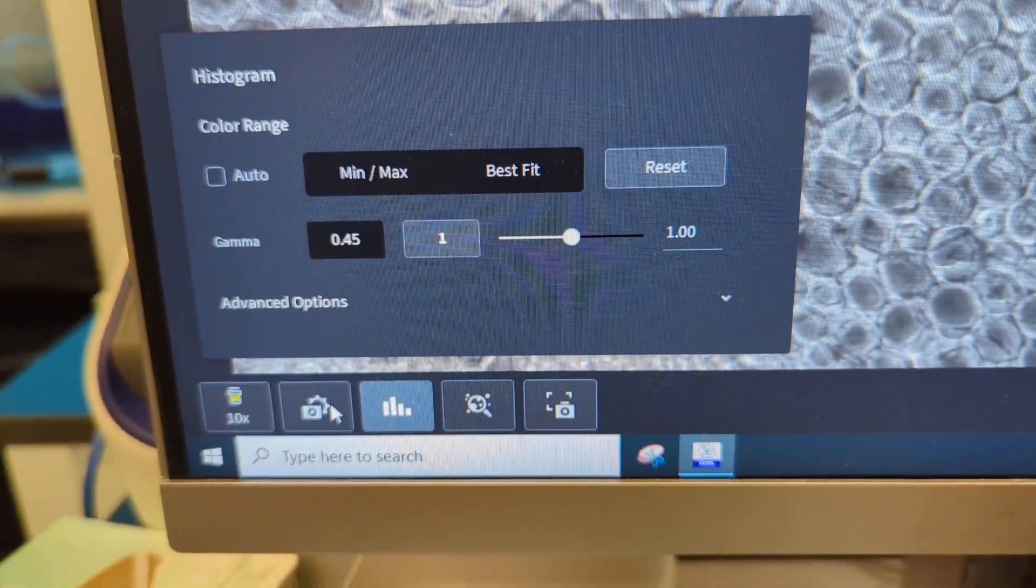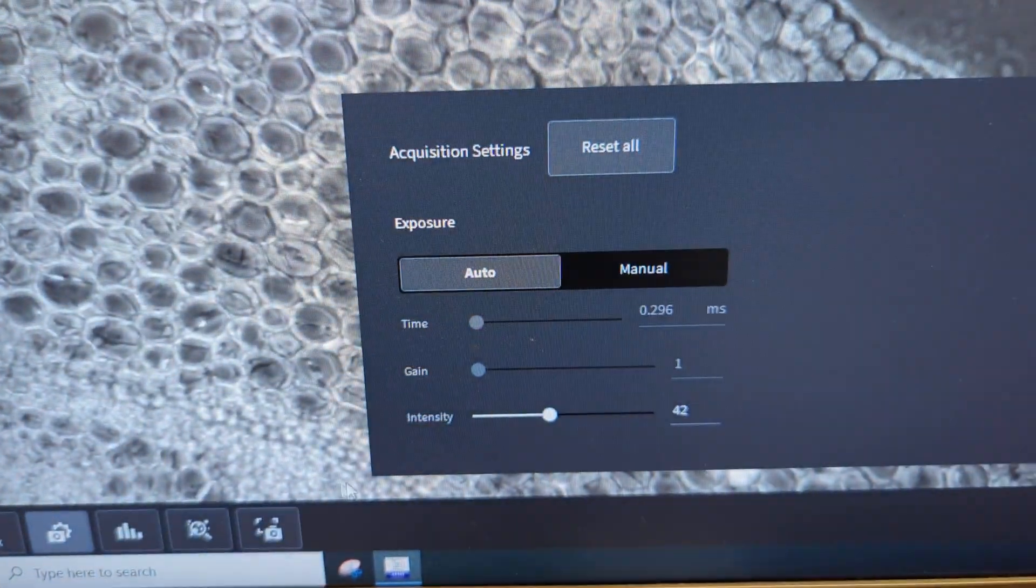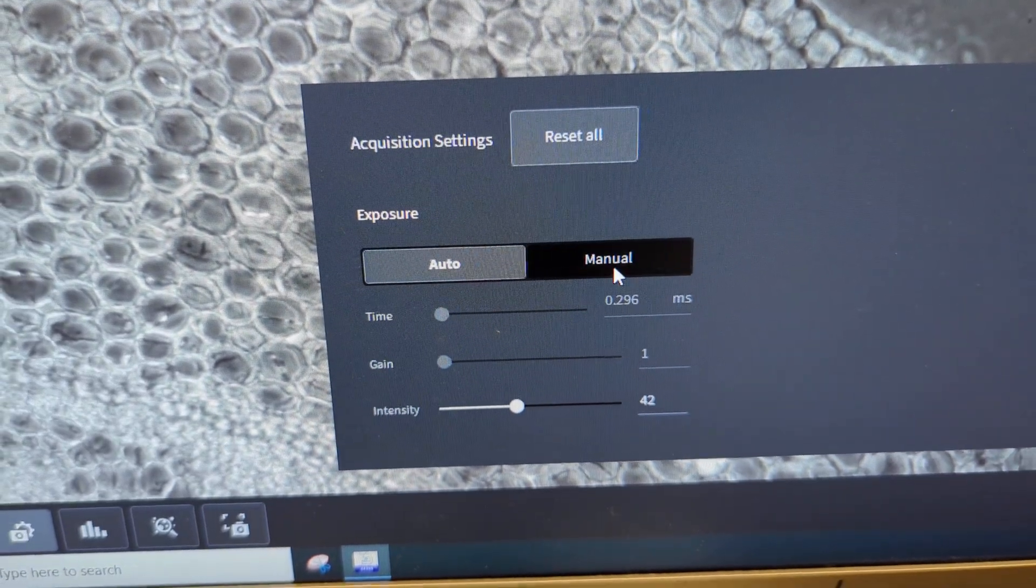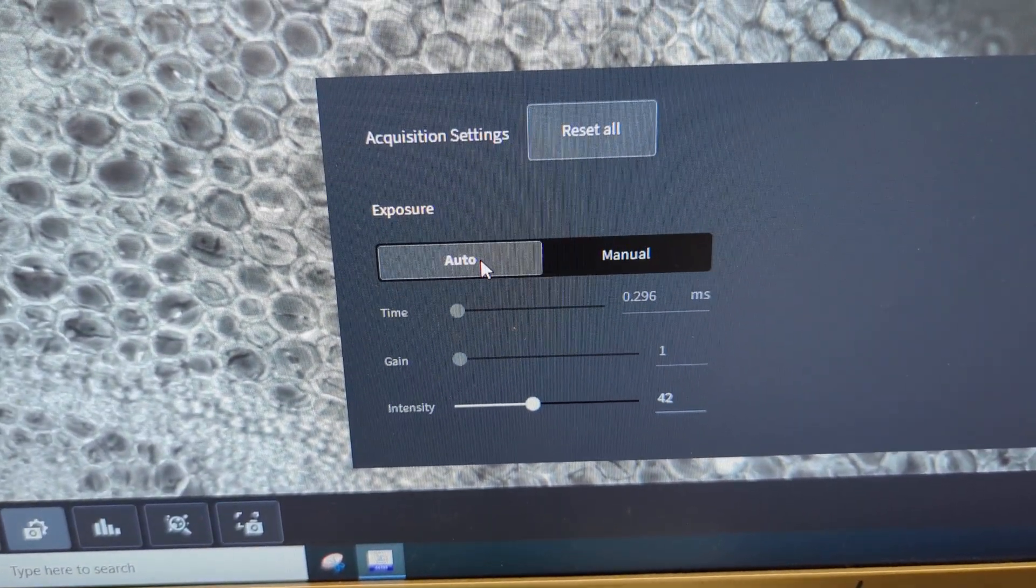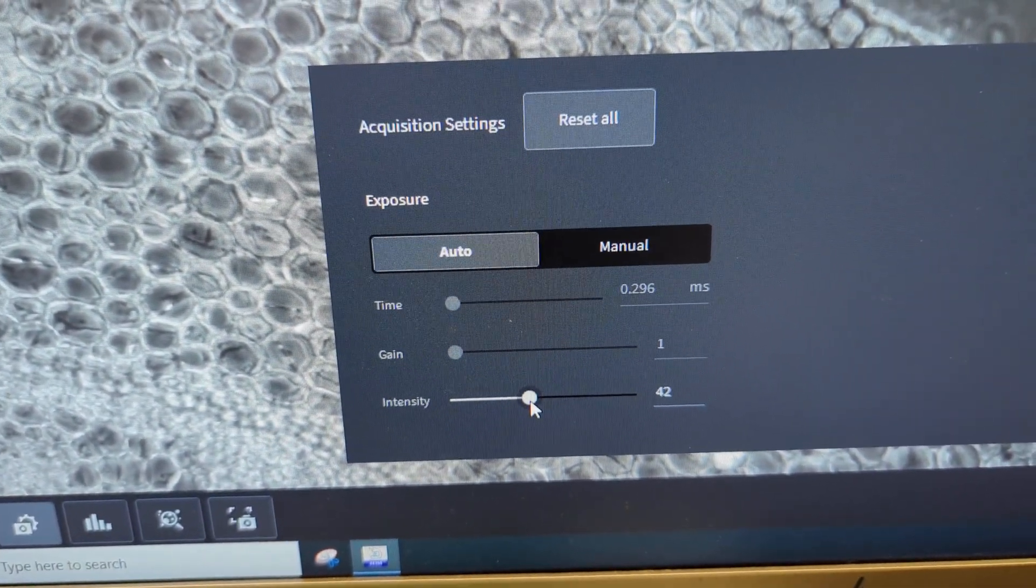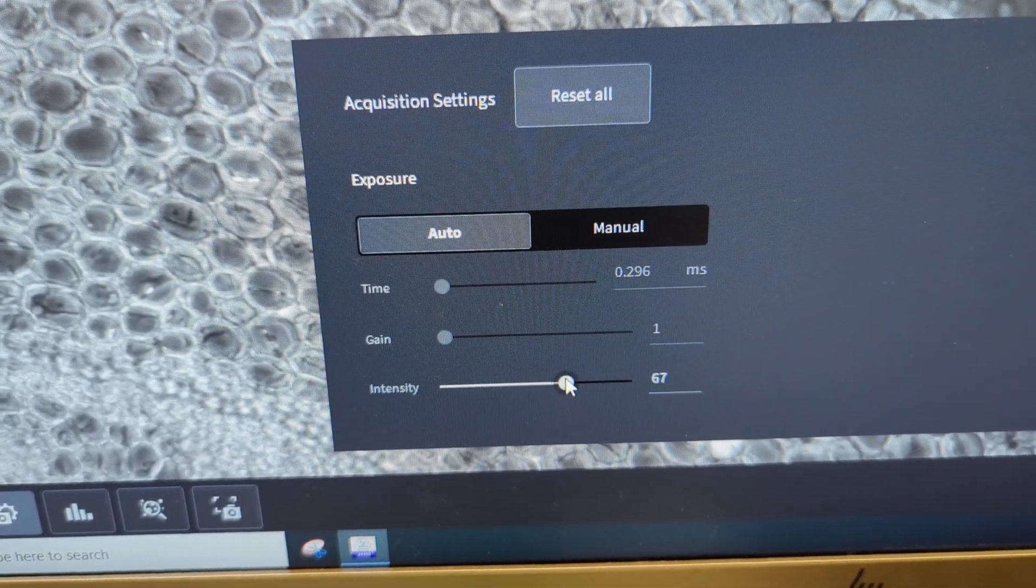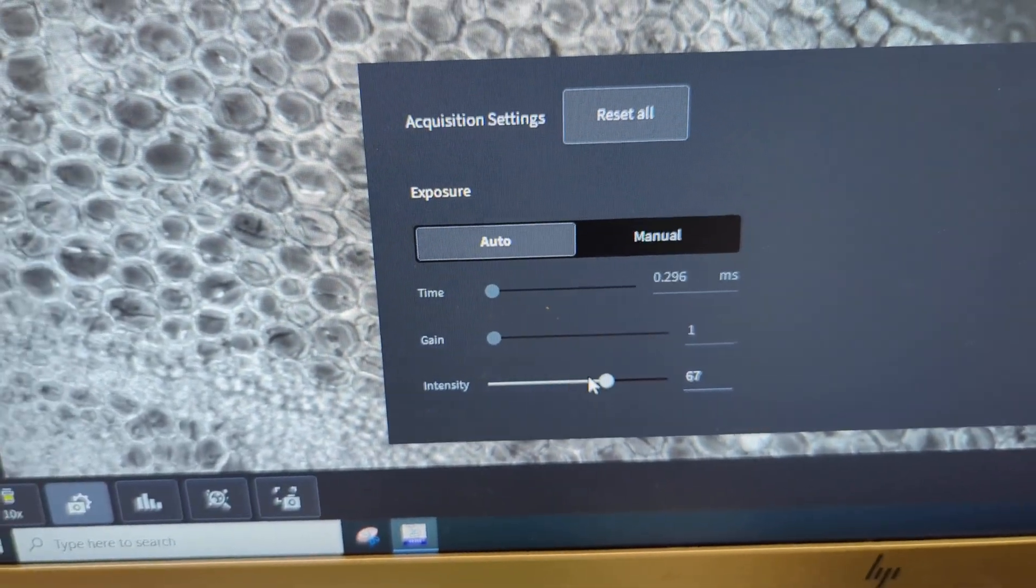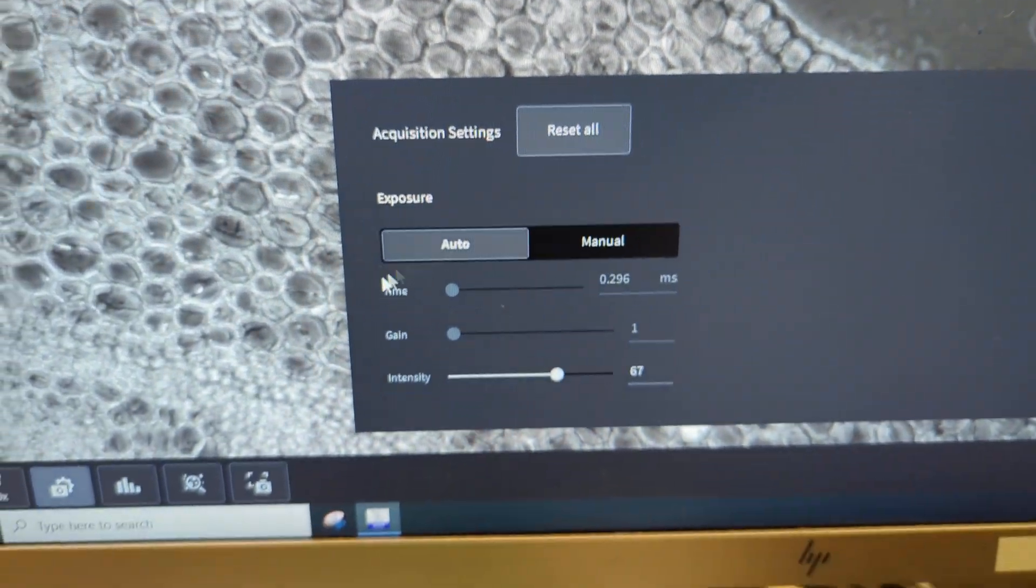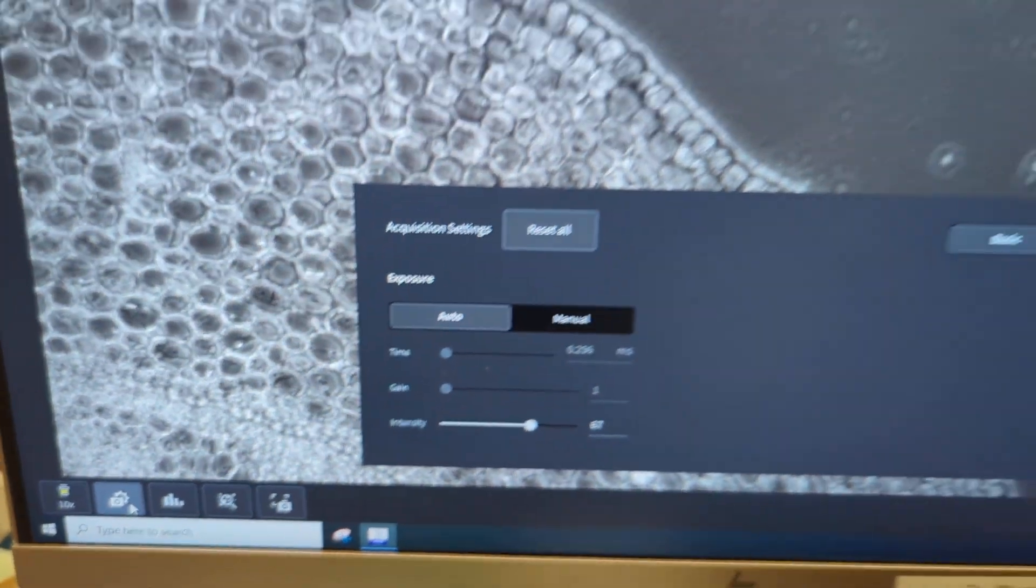And then in this other window here, the most I do is just click from, sometimes I'll click to manual, but usually I just leave it in auto and let the camera and the software do its job, and I'll just adjust the intensity if I want it a little brighter.